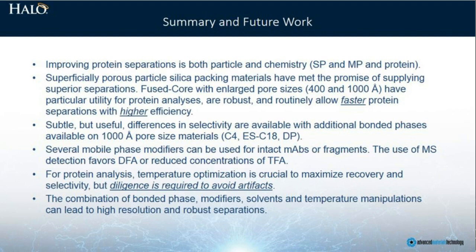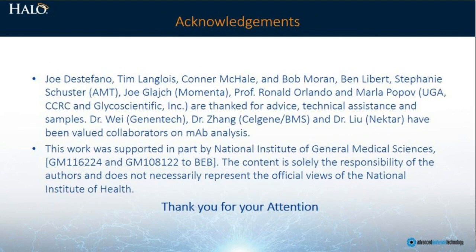As we've been able to get higher resolution separations, we're able to now take a different approach to optimization of high resolution monoclonal antibody separation.